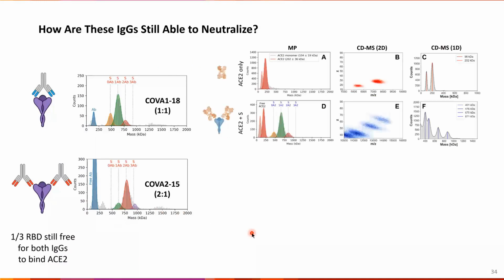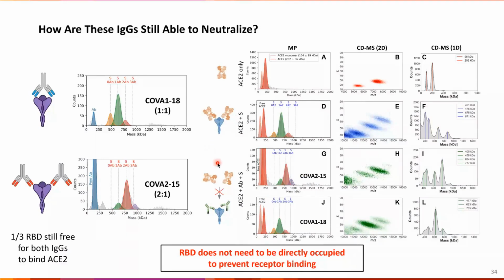So what we wanted to do is measure the binding of the spike trimer against the human receptor, the ACE2 receptor. In the absence of the antibody, we can measure the binding quite well, and we can see that the spike indeed binds the cellular receptor. However, if we pre-incubate the spike with an antibody and then add the ACE2 receptor, we see that despite not binding the full complement of 3 antibodies, we still lose all binding of the ACE2 receptor. So despite not binding as many antibodies as we thought, these antibodies remain fully effective at neutralization and at blocking interaction with the ACE2 receptor.